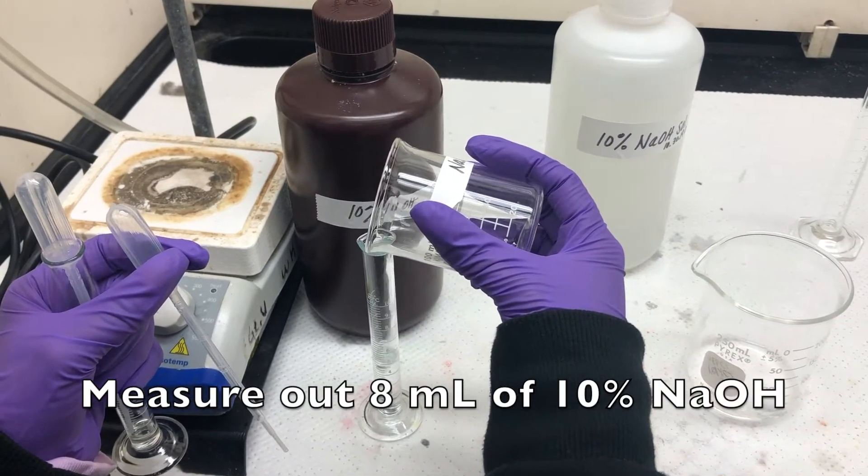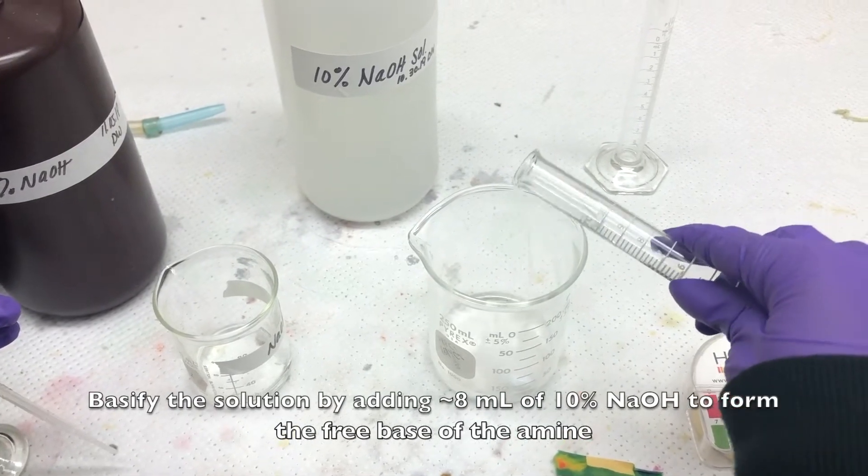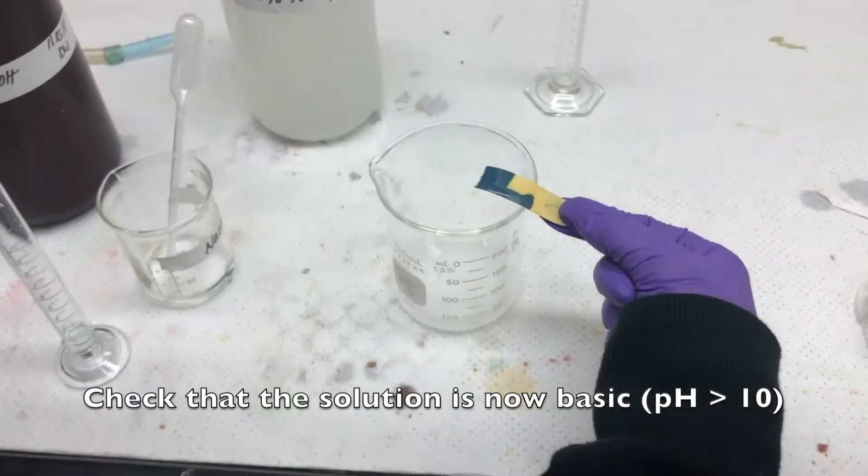Measure out 8 milliliters of 10% sodium hydroxide. Basify the solution by adding the sodium hydroxide to form the free base of the amine. Check that the solution is now basic.